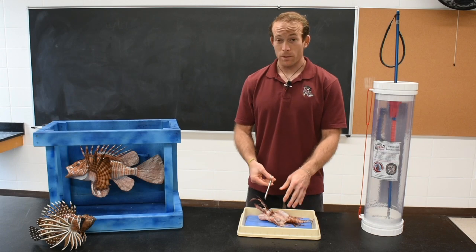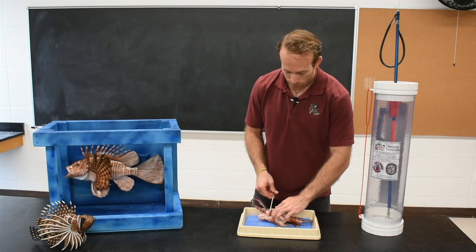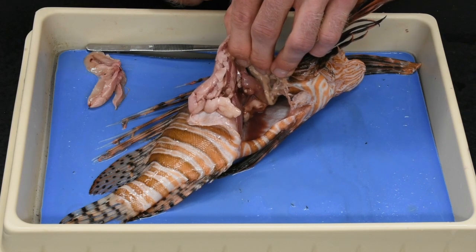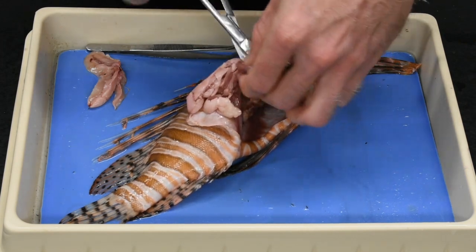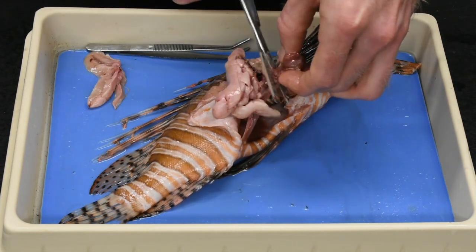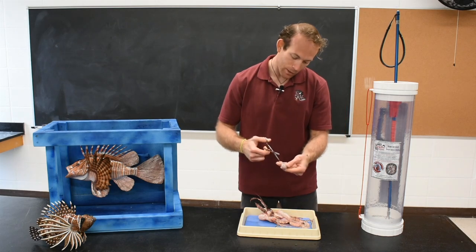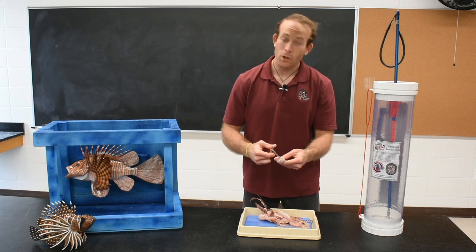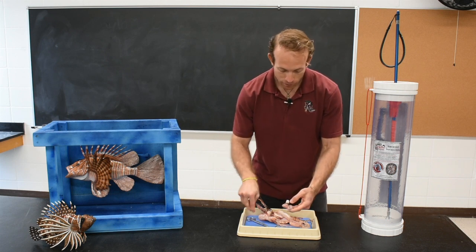Now I'm going to open up the stomach to see the prey contents inside. I'll remove the stomach in its entirety — straight from the esophagus down into the gut cavity — then make a cut inside the stomach and open it up to see what this fish last ate.